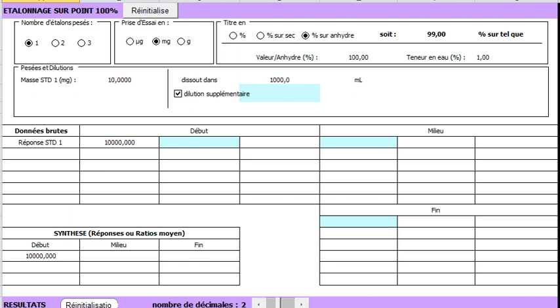Here we enter the weight values. Here the dilution volume of the standard. Here we could select the further dilution of the standard, but this is optional.